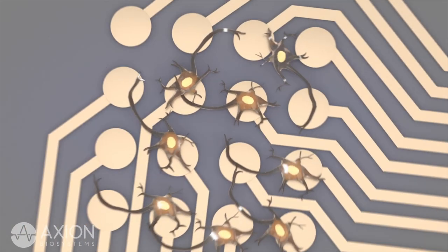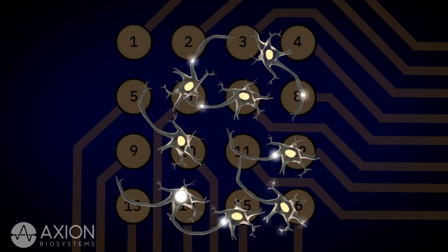Spikes are simultaneously detected from multiple electrodes across the array, making it ideal to monitor activity throughout the culture and investigate network behavior.